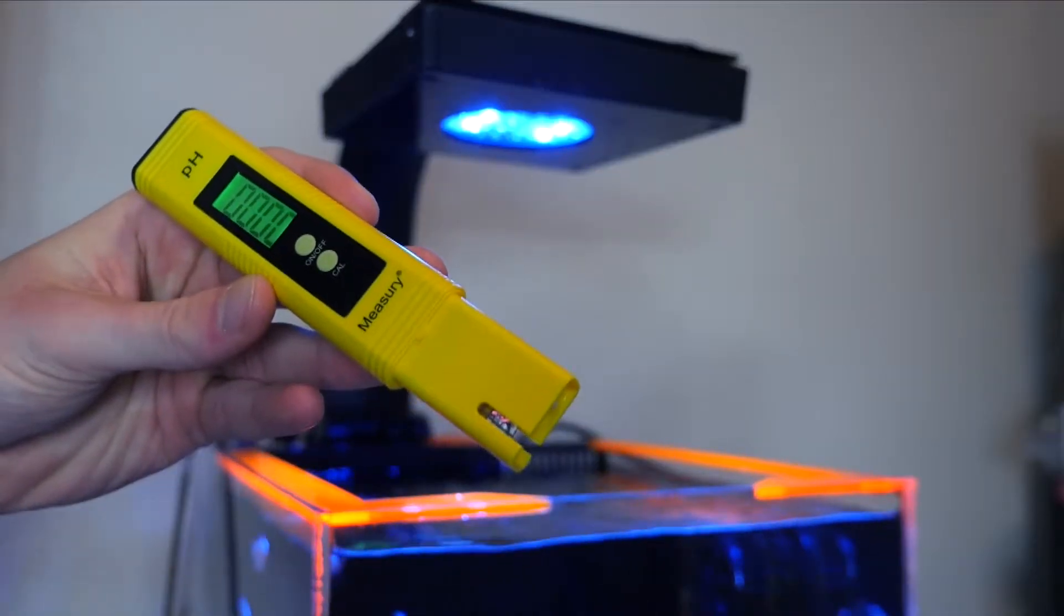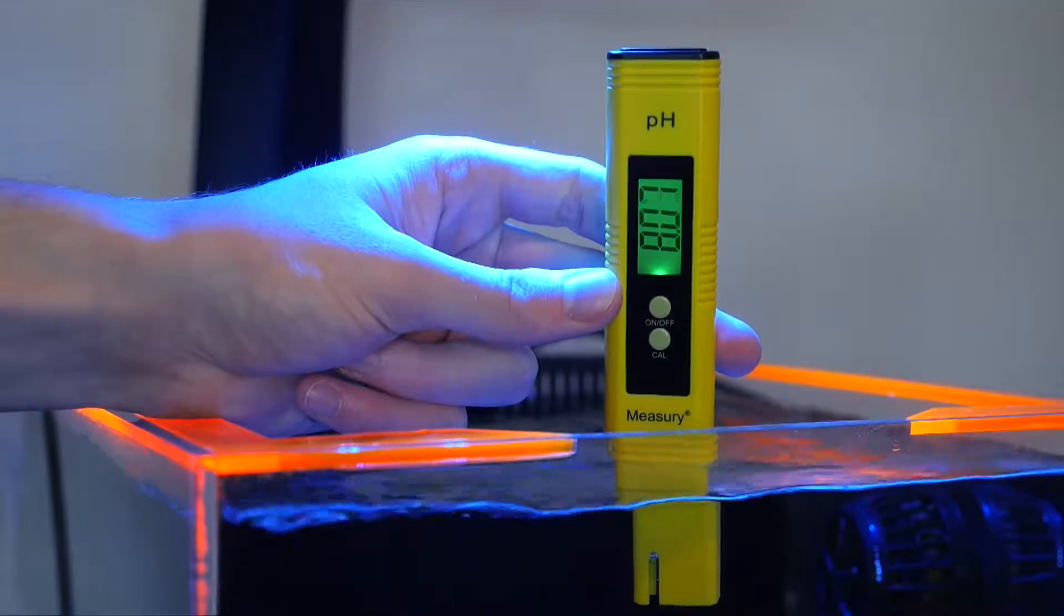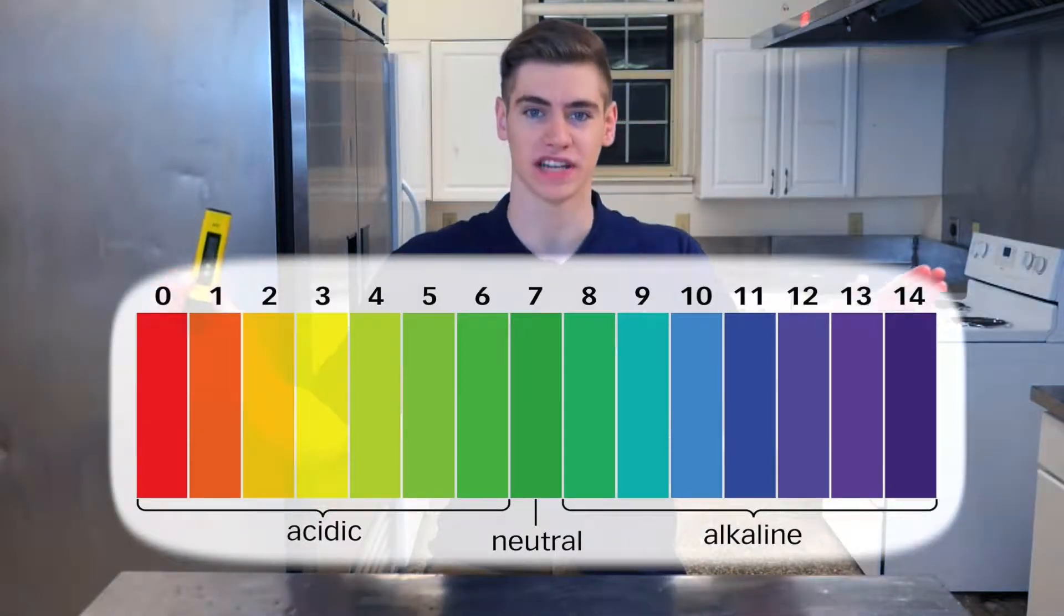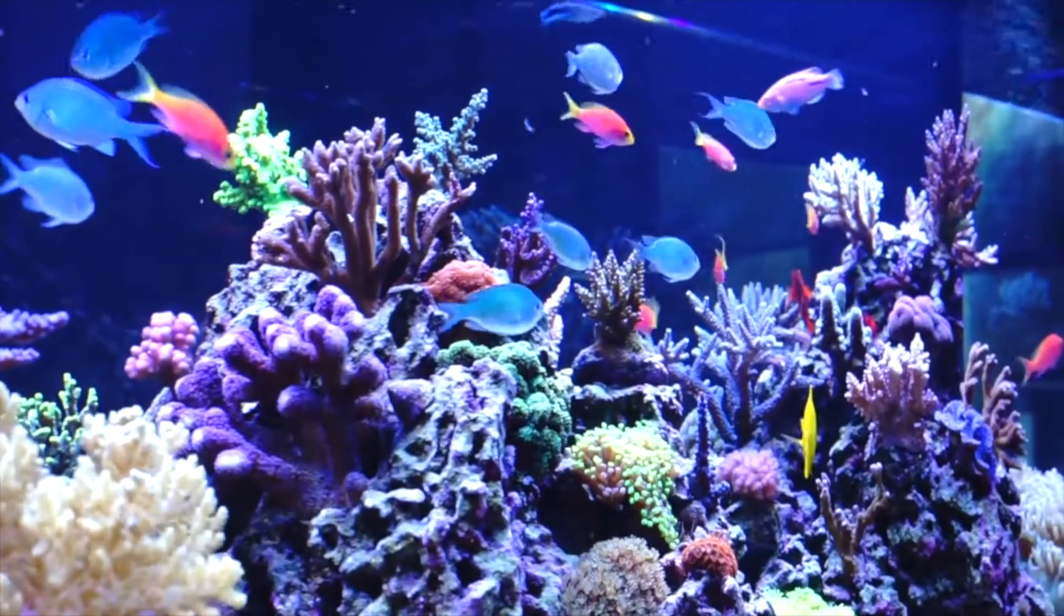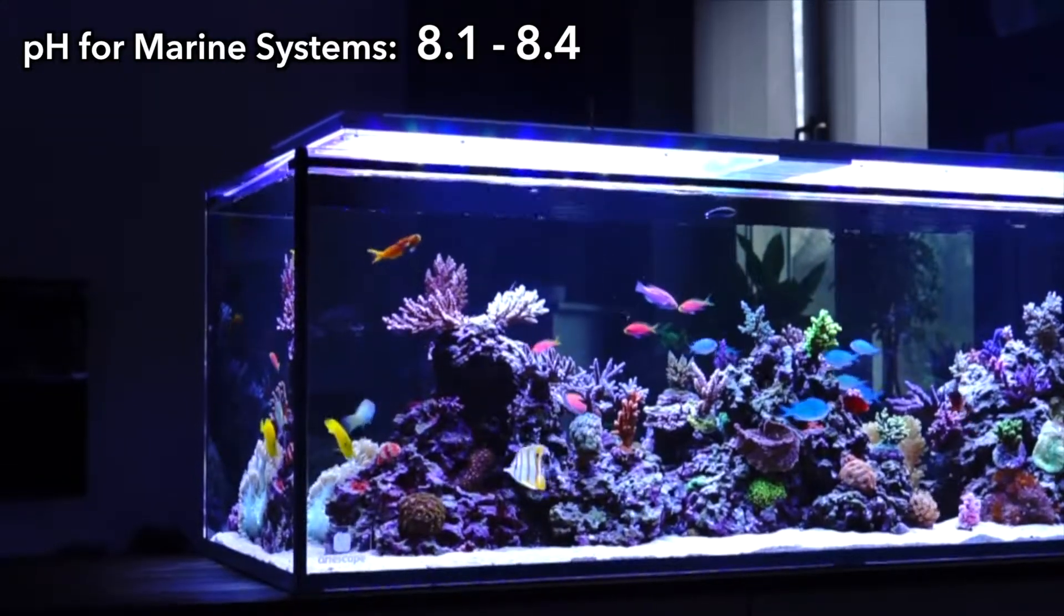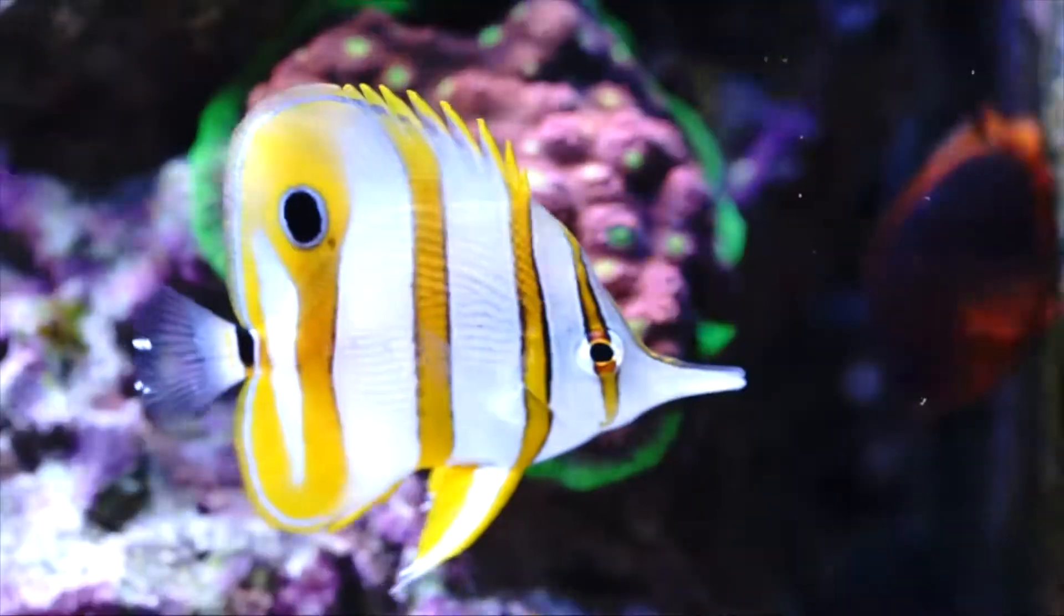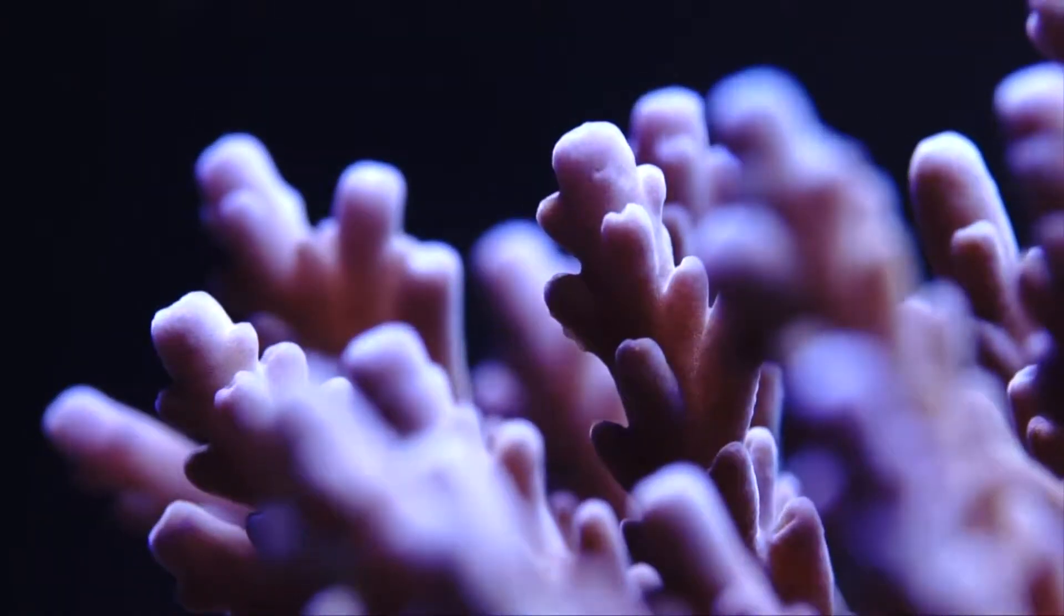The Measury pH Meter provides instant measurements at the touch of a button, and they're displayed electronically on an illuminated screen. The meter is capable of displaying the entire pH scale from 0 to 14 with an accuracy of two decimal places. Testing for and maintaining the correct reading of 8.1 to 8.4 for marine systems helps fish resist illness and also keeps coral from calcifying at an accelerated speed.